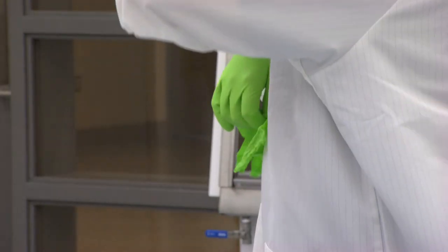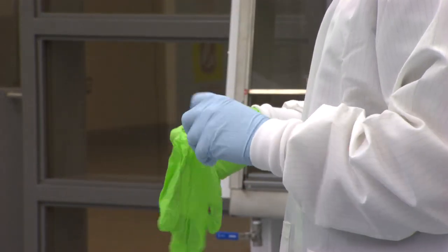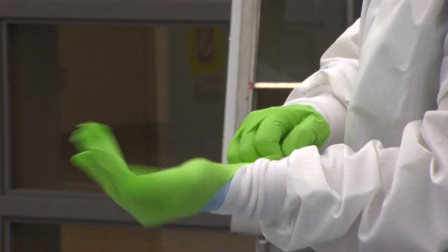Now, when you're actually working with microorganisms — so handling them inside the biosafety cabinet or other primary containment device — you actually put on another layer of gloves just in case you have exposure, so you have one layer to take off.